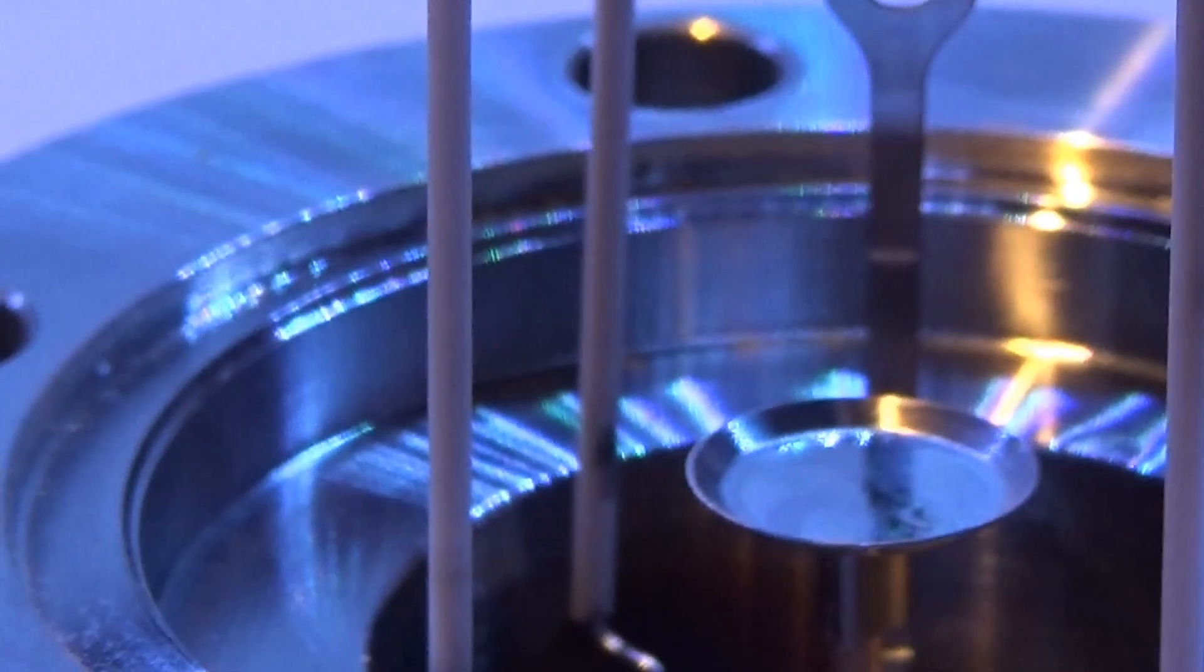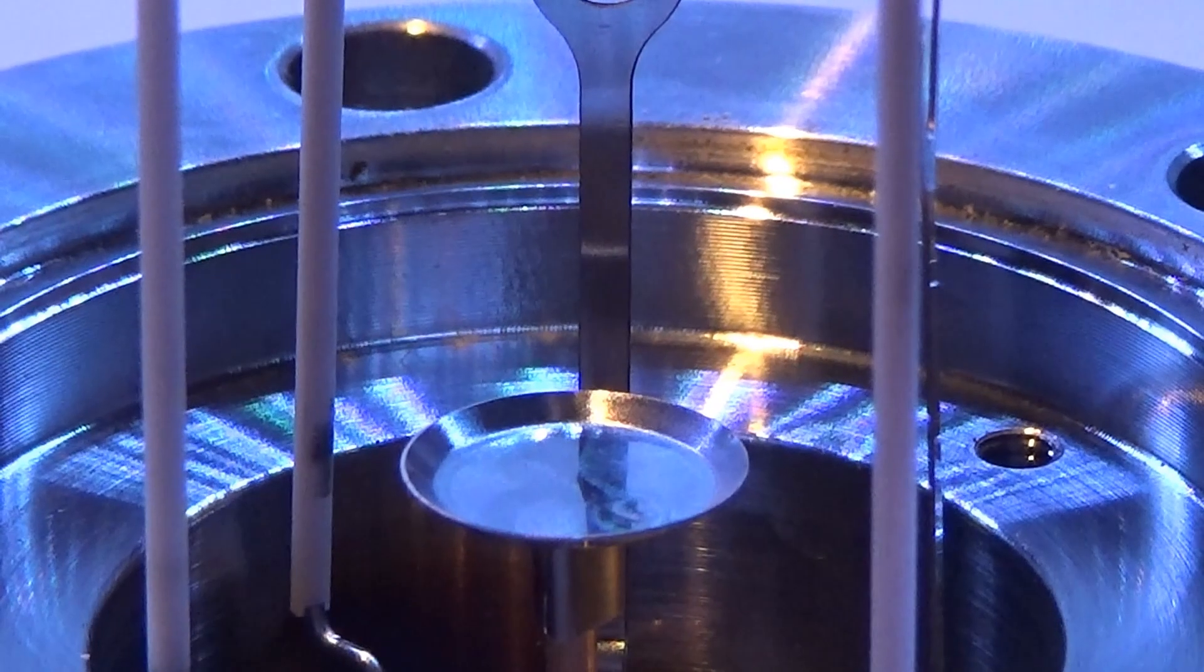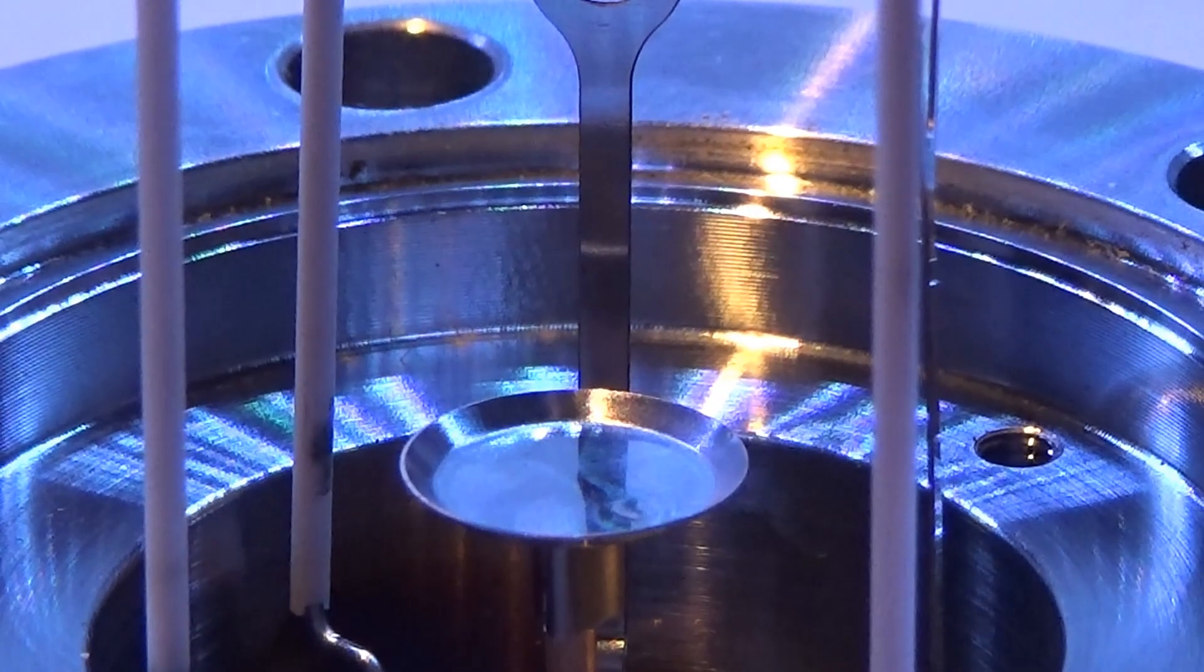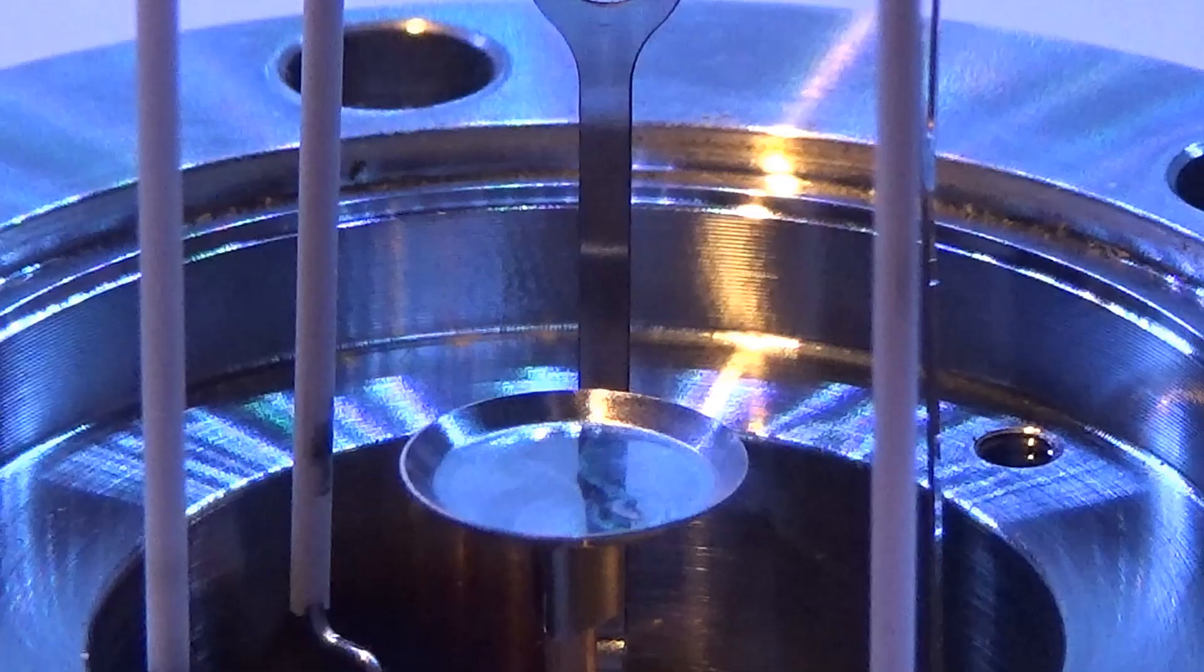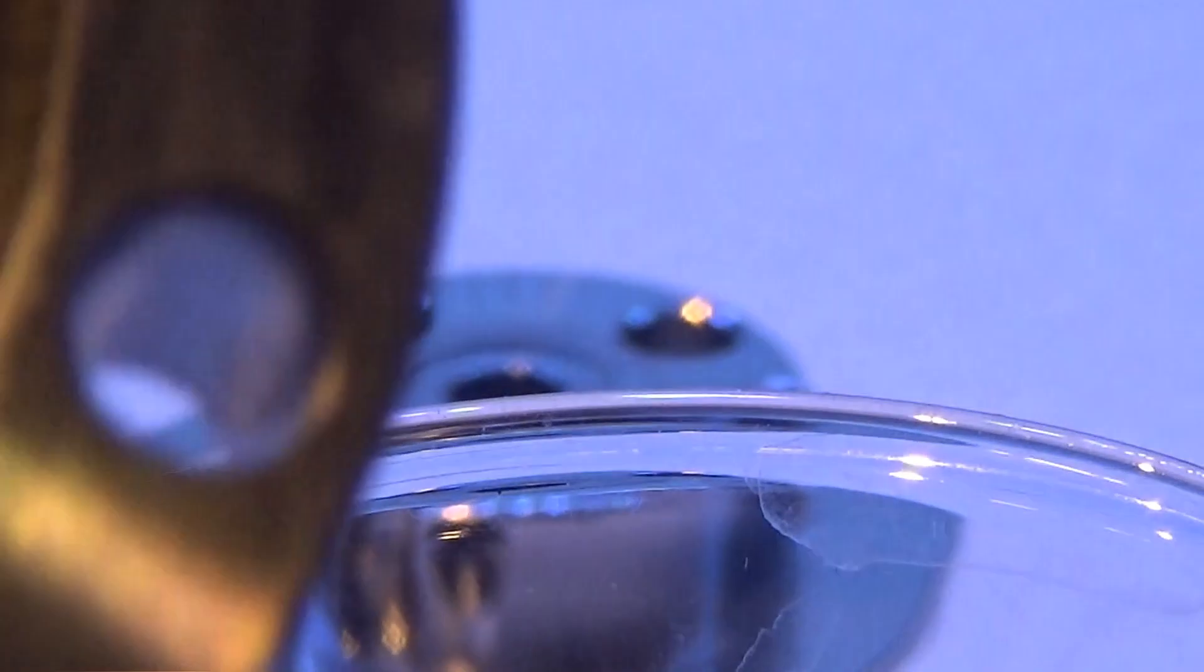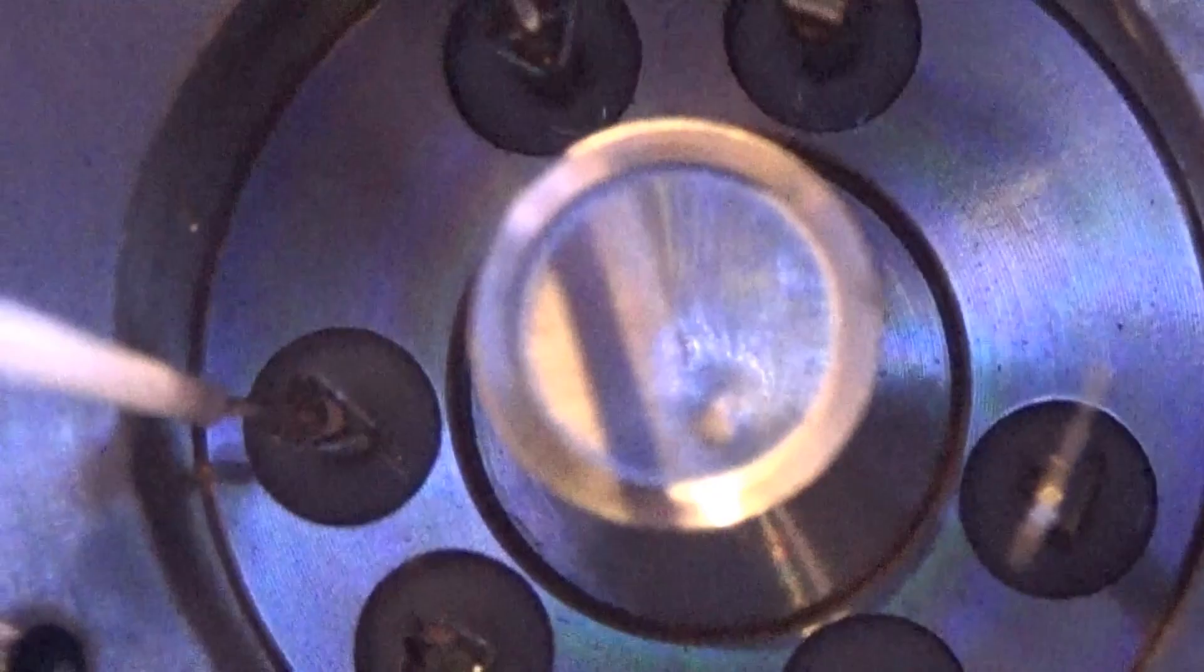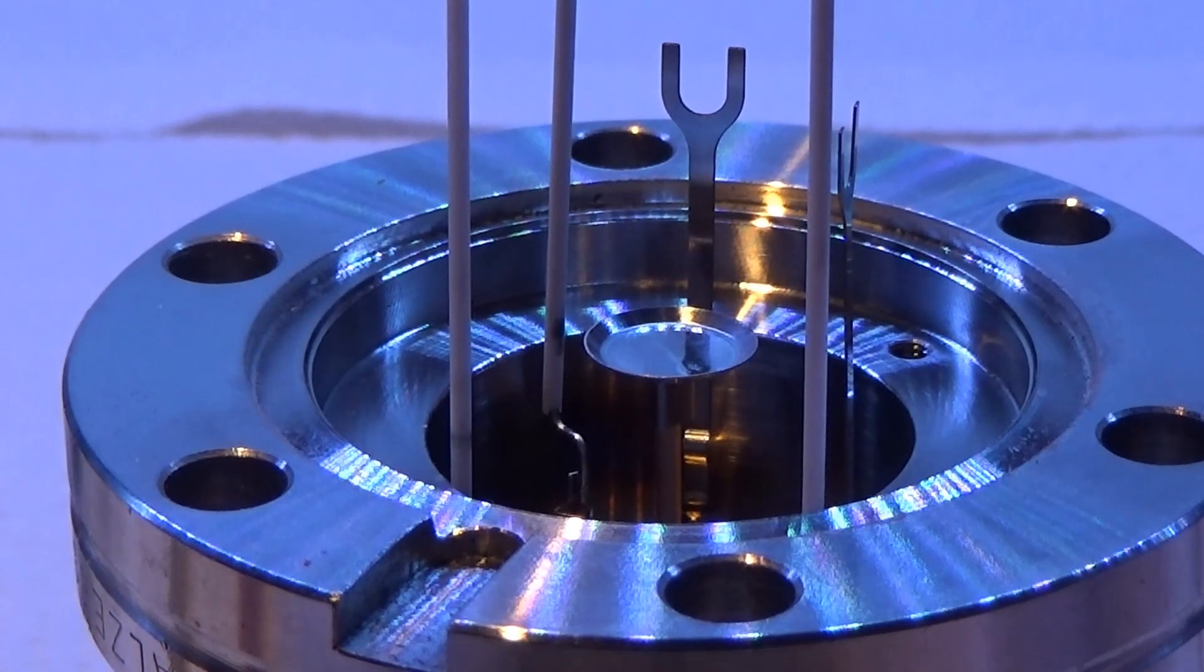This is what's called a Faraday cup, or a collector. So ions will hit this plate and generate a tiny, tiny current. What you then need on the output side, and you can see, all these pins are now just connected directly outwards to the feedthrough, as we saw from the inside.